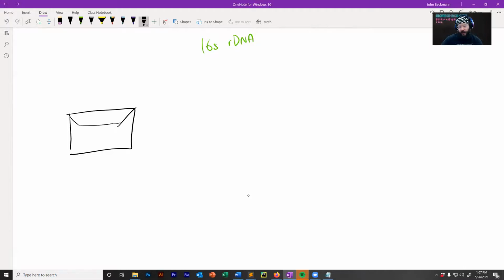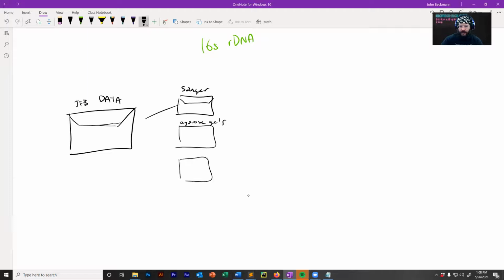So somewhere, again, to reiterate, and for everybody watching this, you should also have some folder that is your initials data. And within that folder, you should have a subfolder where you have Sanger data. So maybe you have one subfolder that's agarose gels. Maybe you have another subfolder that's SDS-PAGE gels, which are proteins. And you have some other subfolders discriminated by different data types.